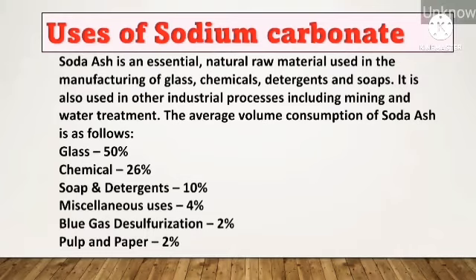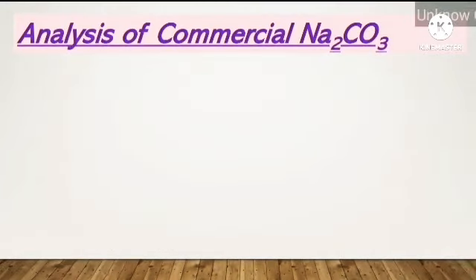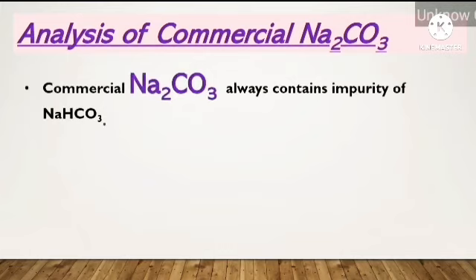Now I'm going to tell about the analysis of commercial sodium carbonate. Commercial sodium carbonate always contains the impurity of sodium bicarbonate.